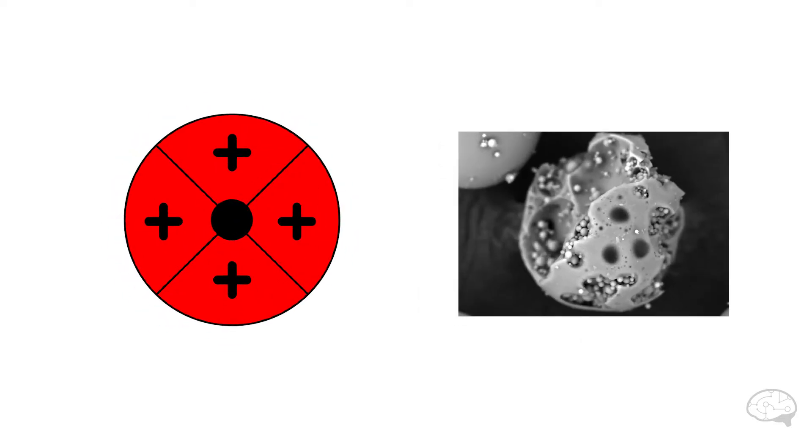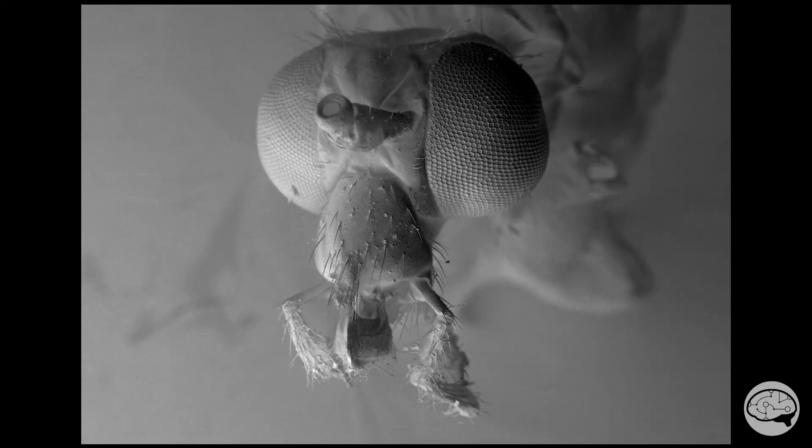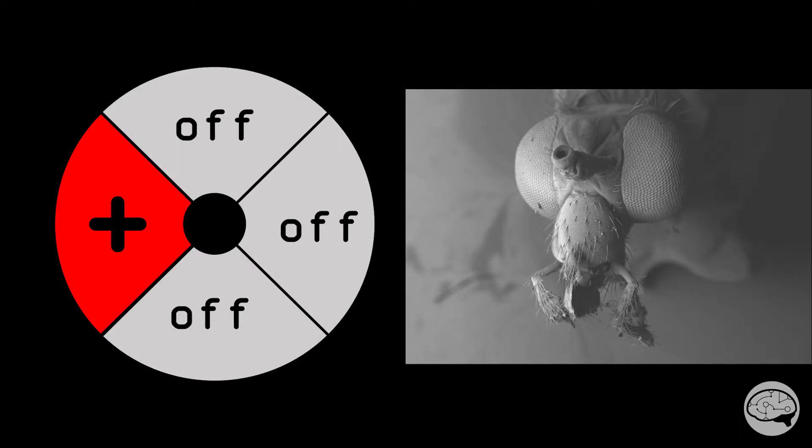Now, when I say BSE image, I mean a BSE image with all the segments on or positive, just a normal BSE image. Then what we will do is take multiple images using different segments of the BSE detector. These images are what I call the color images, or colored layers, even though they're not in color to start off with. This name will make sense later. There are a few ways to go about capturing them. One way is to take a single image with a single segment of the detector. So in this case, we have the A segment on, and the other segments are off. This gives us a shadow on all parts of the sample facing away from that segment.